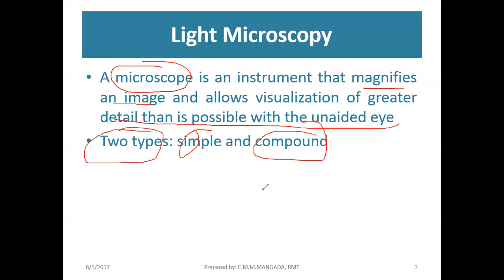So guys, I will be discussing with you later the different types of our light microscope. They are actually under compound microscopes because they contain multiple lenses. But before moving on to the next slide, I have here the link that you can click to read more about the light microscope, its definition, principle, types, and parts of the magnification.